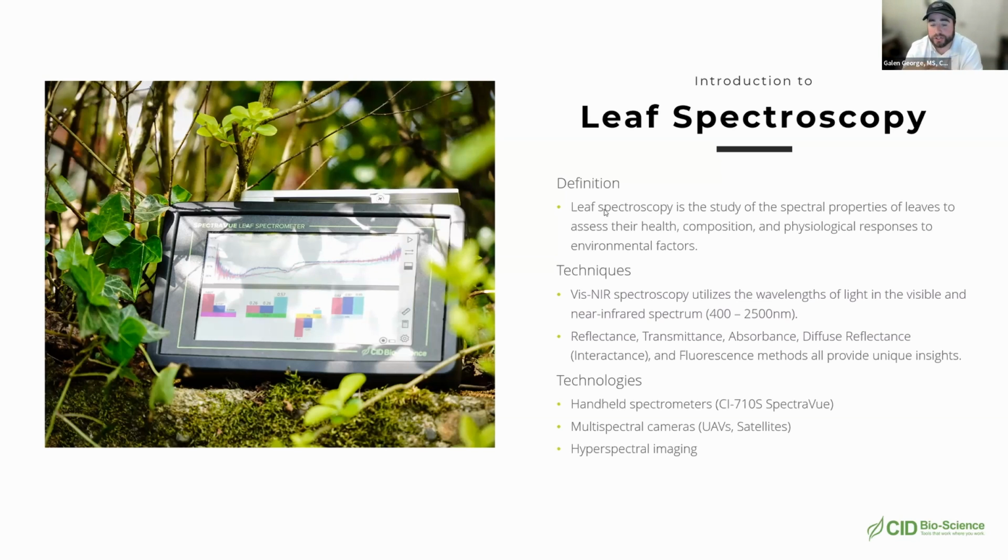Then what you can do is use machine learning. There are a lot of classification algorithms out there, right? So once you have those data sets, I would look into different kinds of machine learning or matrix algorithms that allow for classification, and allow you to basically identify, say, this is what the spectral profile looks like for this tree versus what it looks like for this tree. Have that machine learning model learn about what those different profiles look like and help you go out and identify them in the future. That's what I would recommend.